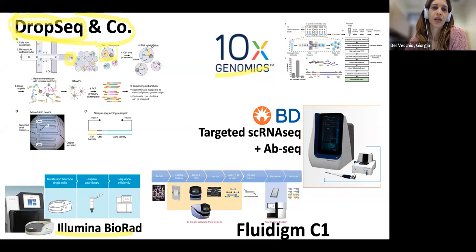And once you capture the cell together with the microparticle, you can label all the transcripts coming from one cell with one adapter. Compared to what we have seen before, where barcodes were meant to label the sample, here we are not labeling the sample, we are labeling the single cell.